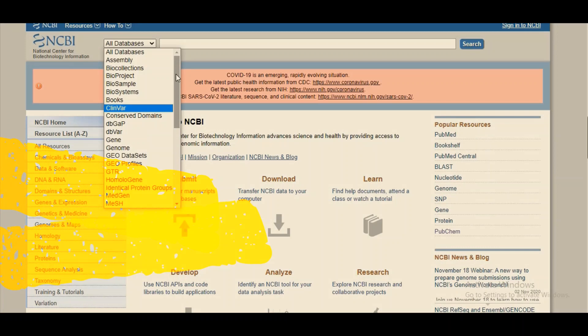Specialized databases contain information about one particular domain of biology. For example, OMIM — Online Mendelian Inheritance in Man — is a specialized database that only contains information about human genetic disorders. Right now, we are interested in the primary database, which is the Nucleotide database.